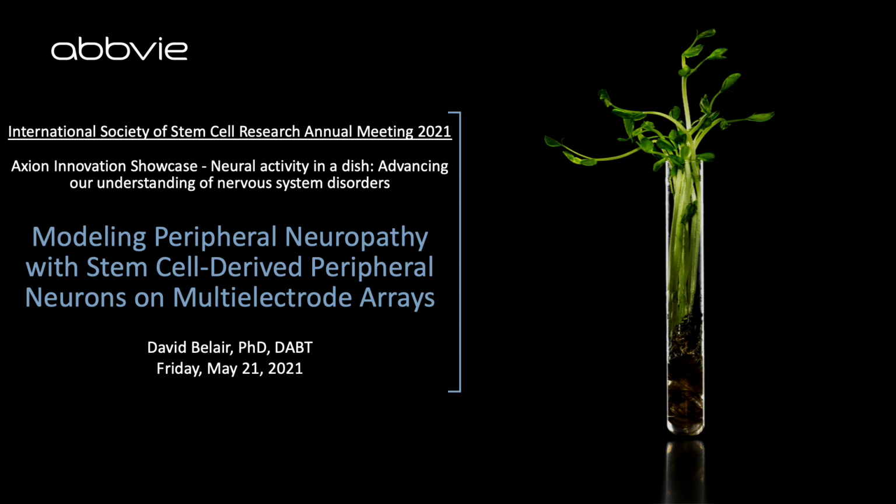Here we used an approach to model peripheral neuropathy using stem cell-derived peripheral neurons. And one of the tools that we used to do that was multi-electrode array, the Axion Maestro system.